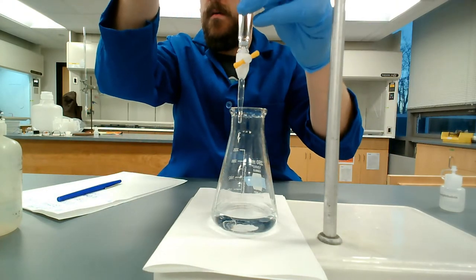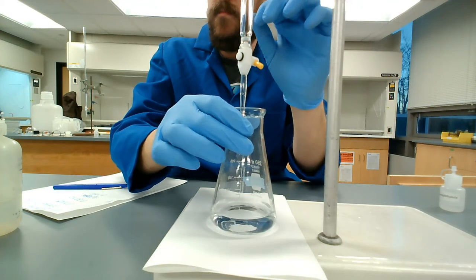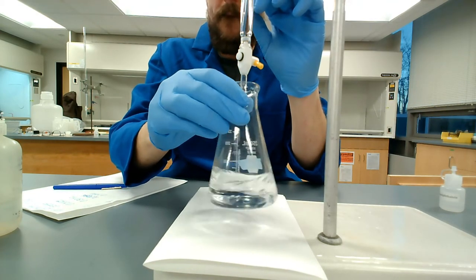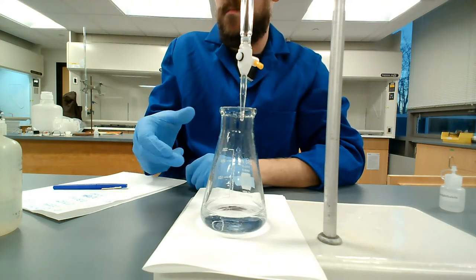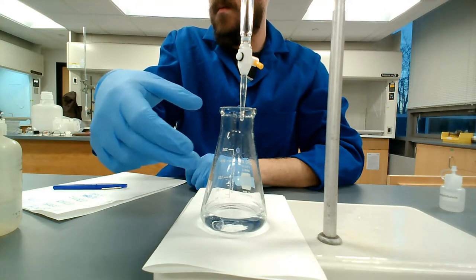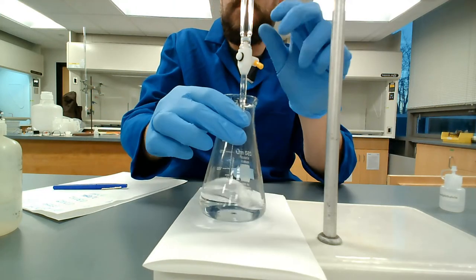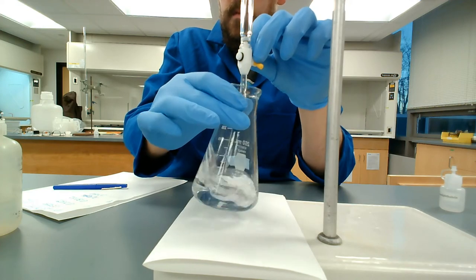So I'm getting closest to the endpoint. I'm rotating the burette here. I'm right-handed. I like to swirl with my right hand, and I like to control the opening and closing mechanism with my left. It doesn't take much to swirl these things. All it takes is a little bit of back and forth with your index finger and thumb and maybe some side-to-side motion with your wrist.